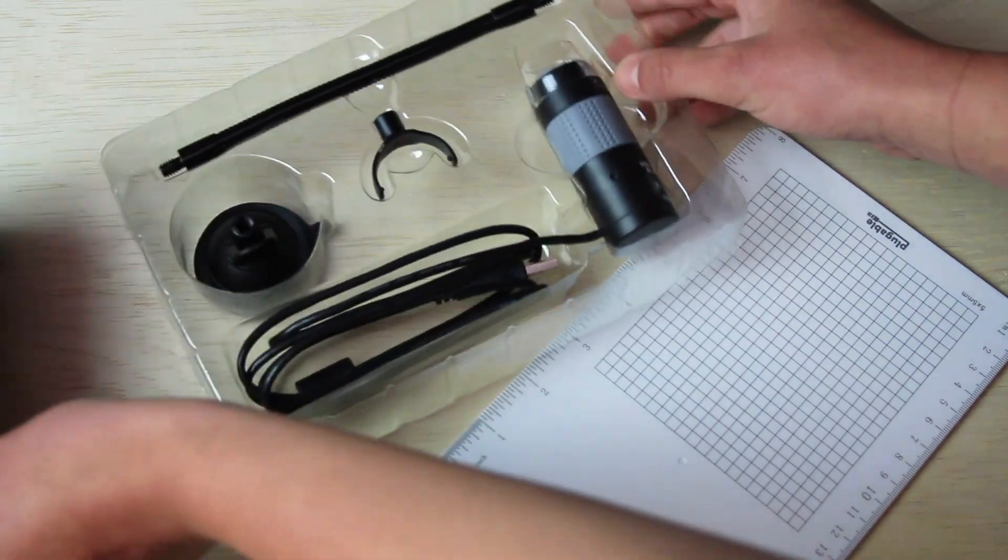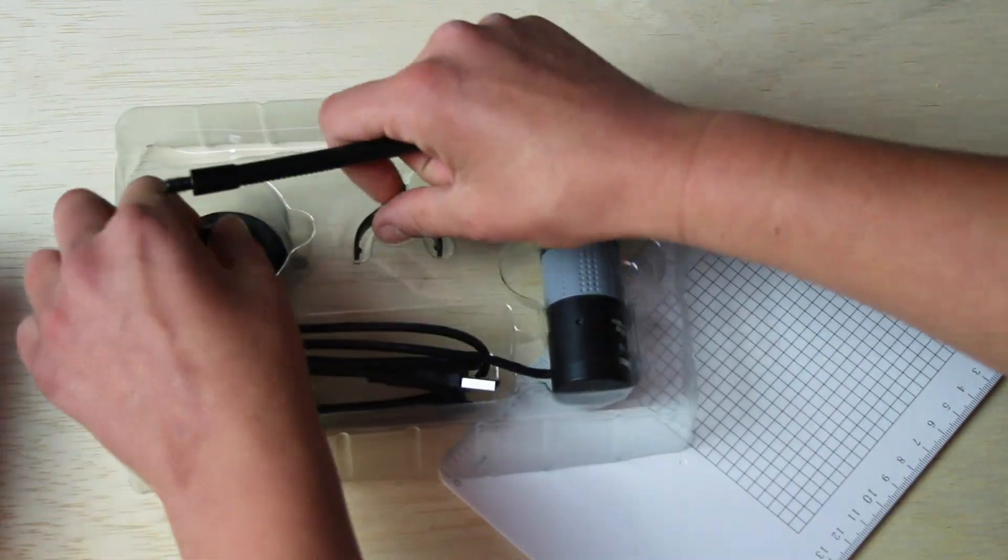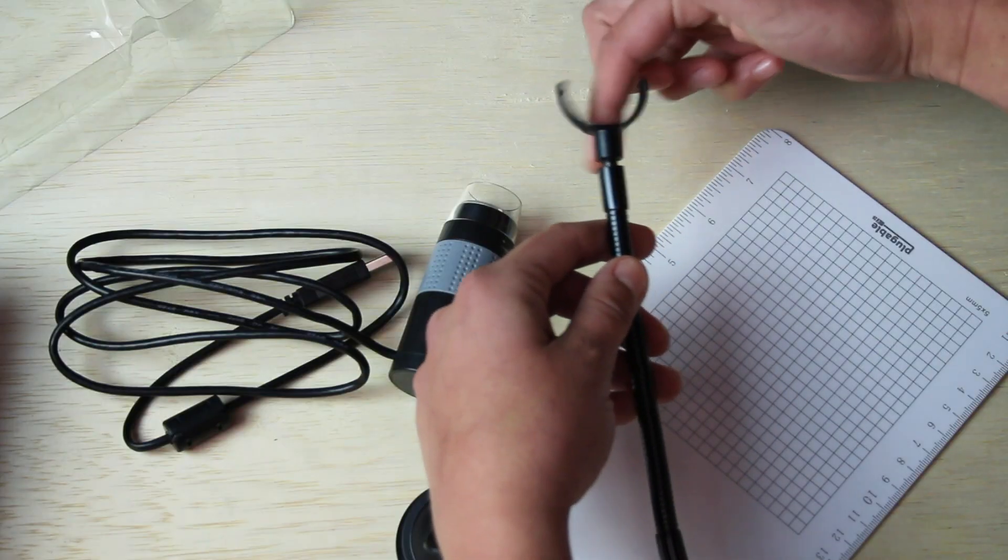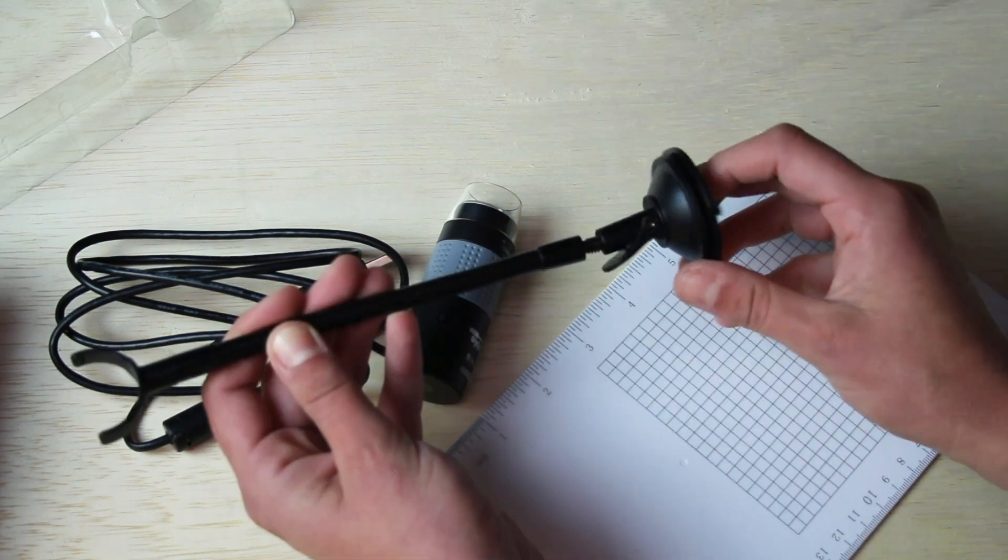To begin setting up your microscope, fasten the U-shape attachment and the suction cup to either end of the flexible arm stand.